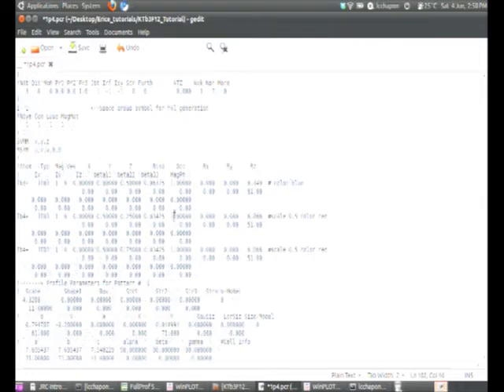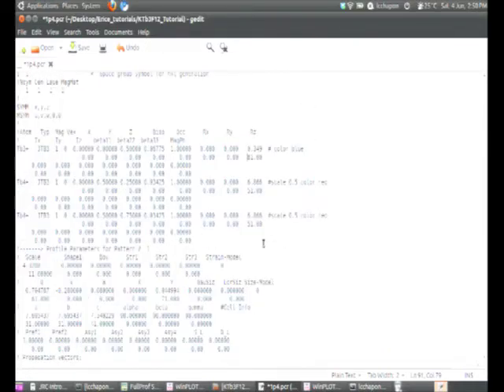So, for example, if I didn't want to refine this parameter here, which has a certain code, there's a convention in FullProf that this parameter number 8, with a shift of 1, will become 81. So if I didn't want to refine this one, I don't need to go there and essentially remove it by hand like that. You can take the full line and put a 0 at the beginning. And you can still run FullProf, and when you return to the file, it will reorder all the coefficients for you. You don't have to respect the number of zeros or the numbers of the parameters and so on.